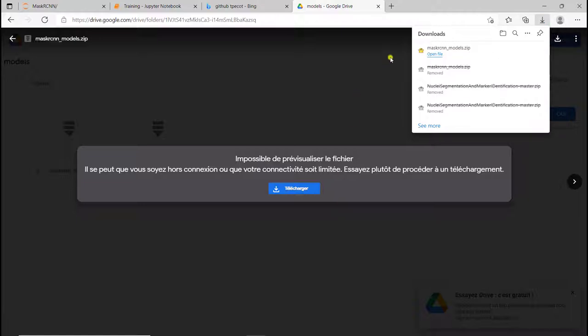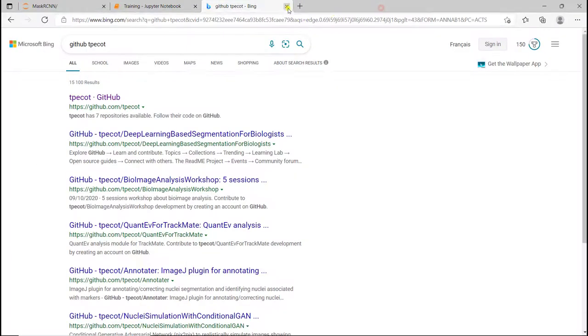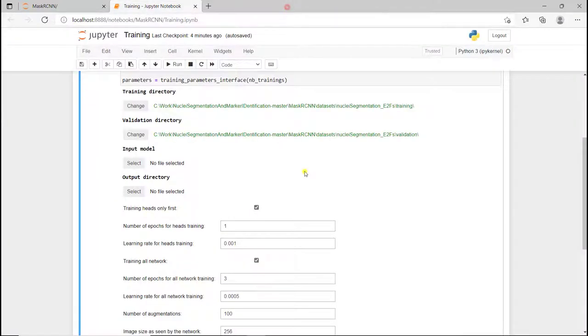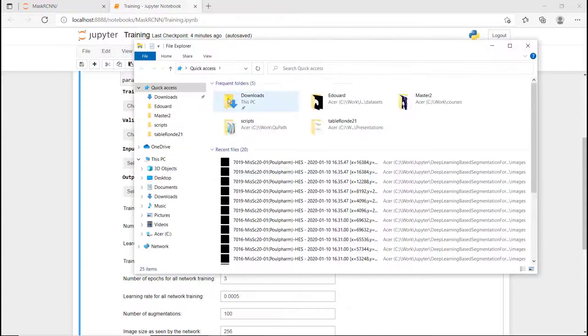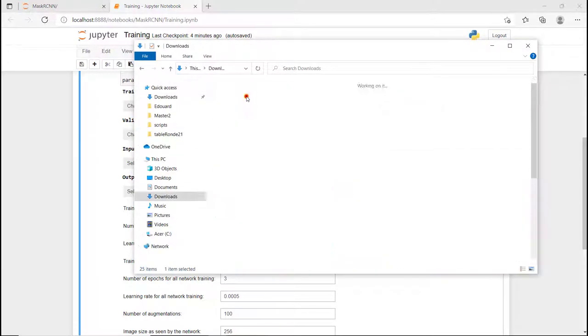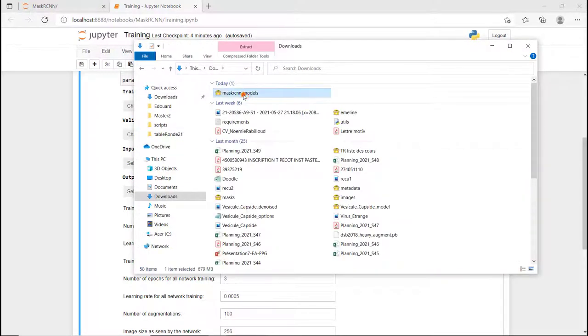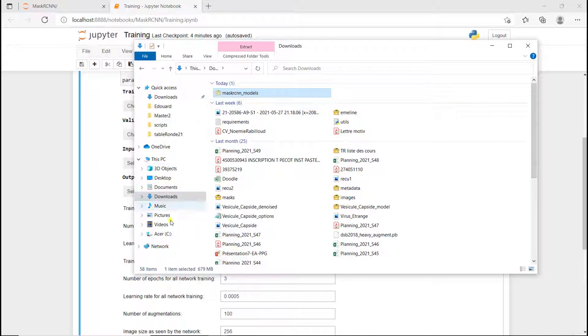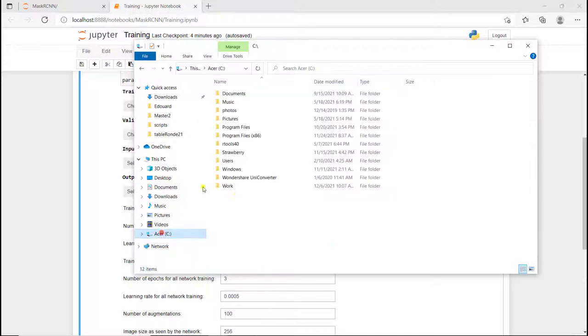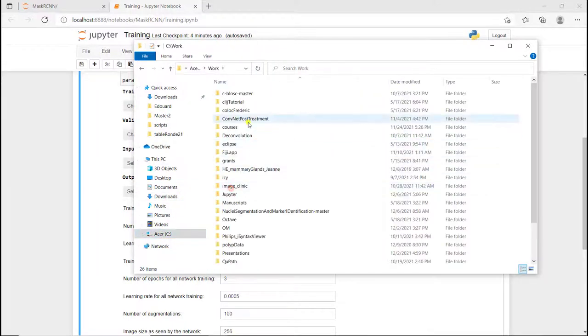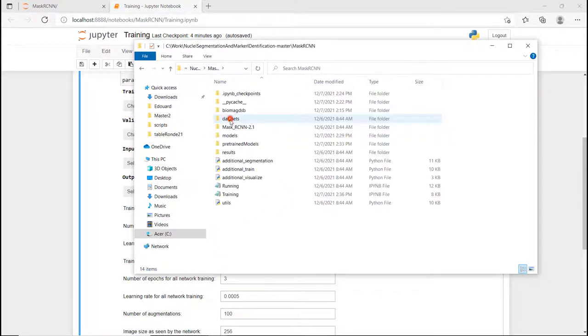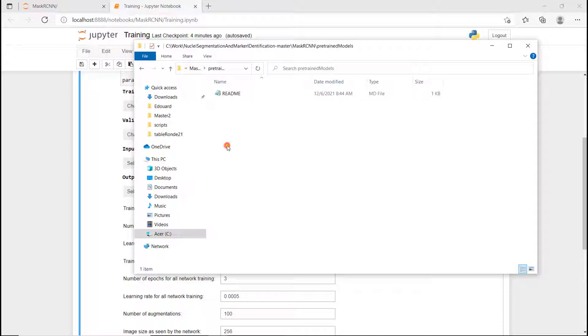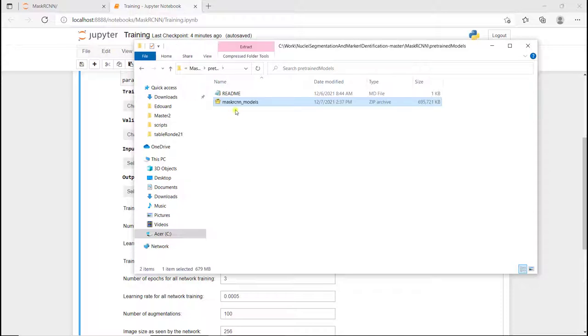Alright, download is complete. I'm just going to close these tabs. I'm going to go in my downloads, cut this zip file, go back to where I put my GitHub folder, going into Mask R-CNN, pre-trained models. I'm going to paste it here. I'm going to unzip it here, extract here.